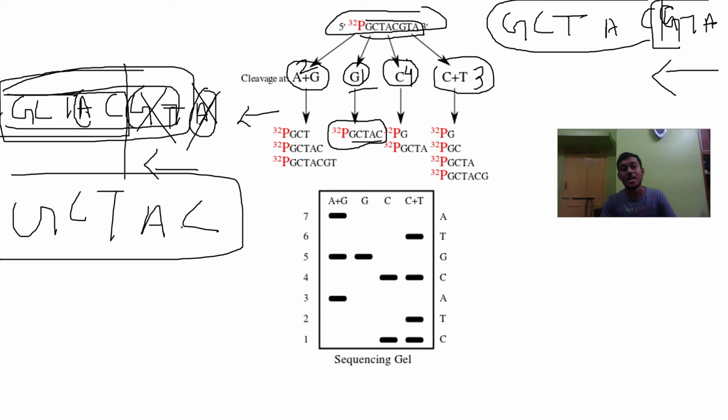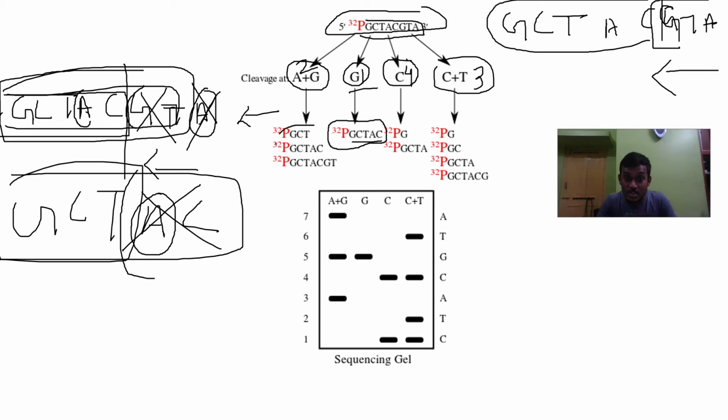So now it will again scan, and we have found again a base here. So it will remove this particular part as soon as it encounters a base, and the rest it will take, which is GCT. So you can see here we have 3 sequences. So it will keep on scanning. As soon as it scans, the rest of the sequence it will be taking, and the rest of the sequence it has, it will go on scanning again. So it will keep on scanning and scanning to remove all the A and the G bases.